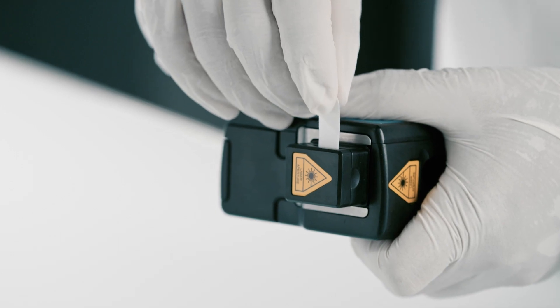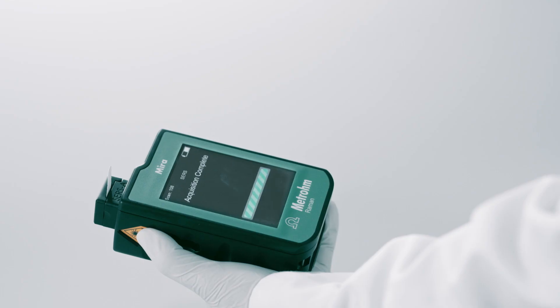Dip. Insert. Touch a screen. Save the result.